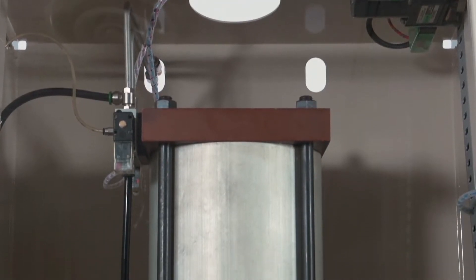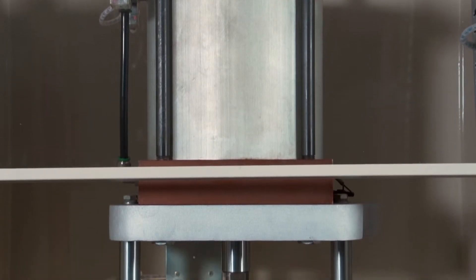Both the main compression cylinder and clamp cylinder are rebuilt, tested, and equipped with new solenoid valves.